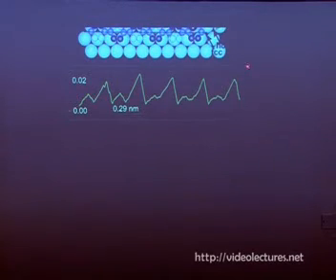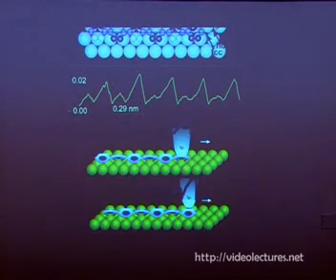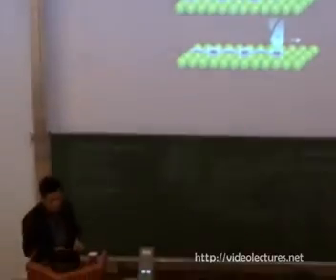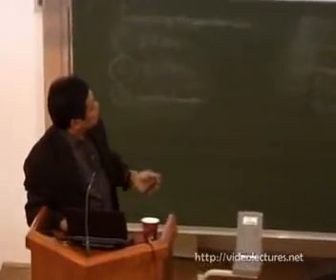Now, in order to detect how the molecule moves, we put the tip at one side of the molecule, here at the edge, and we laterally move it. It appears that at every single atom distance, we see these signals: low, high, low, high. What happened here is we detect low because the pi ring is down, because the tip is positioned at the edge of the pi ring, and when the pi ring goes up, the tip moves up, and we see the high signal. So with every single atom movement, this pi ring is moving up and down like this. We are detecting low and high signals. So now we know that during the movement, the pi rings are flipping back and forth. And luckily, this atomic corrugation also matches the substrate corrugation.